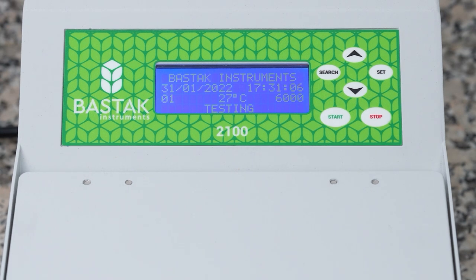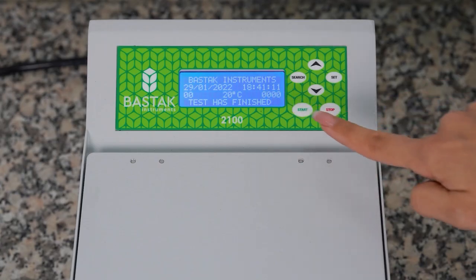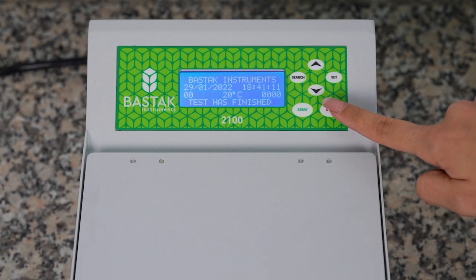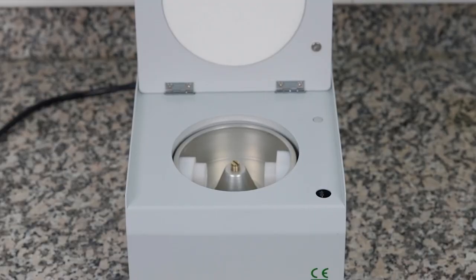When the test is over, the device gives a visual and audible warning on the LCD screen. Press the stop button. The cover of the device is opened and the cartridges are removed.